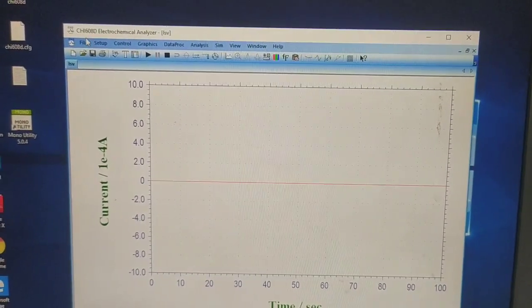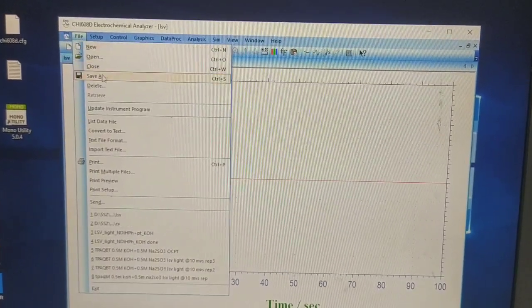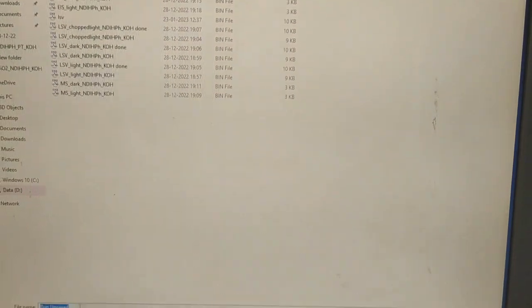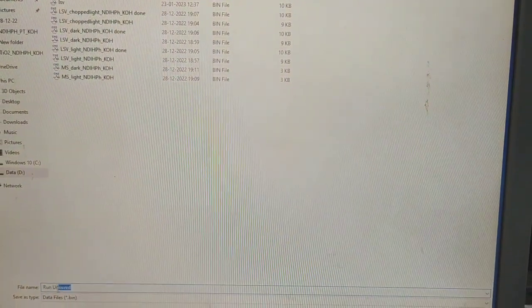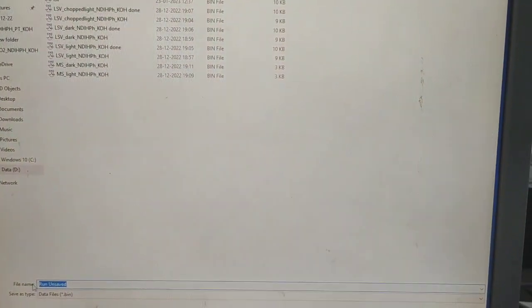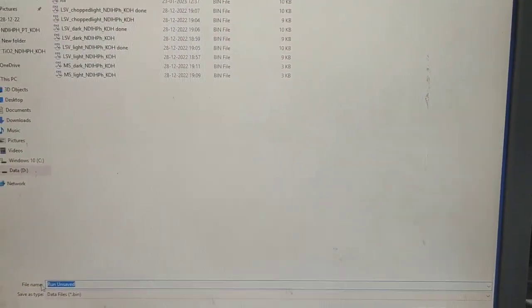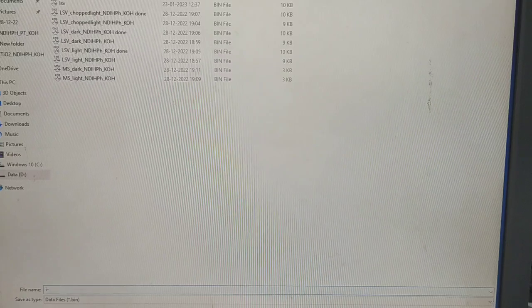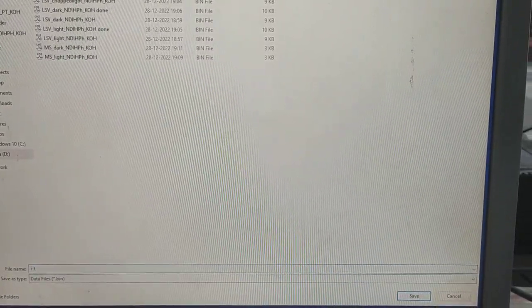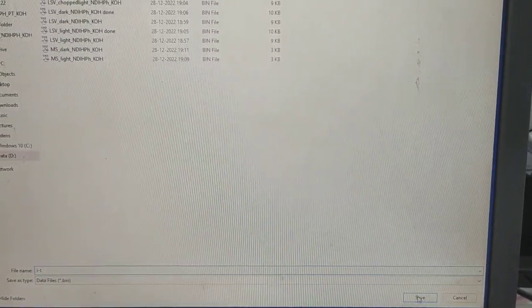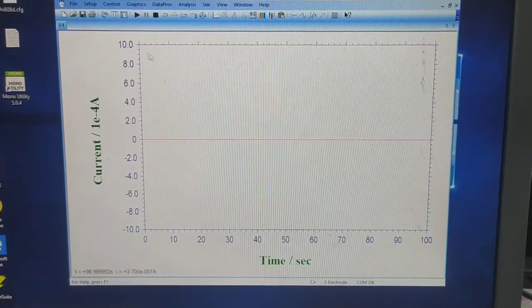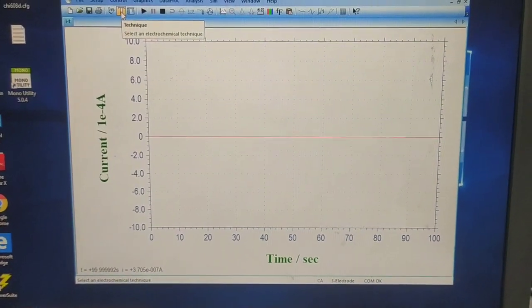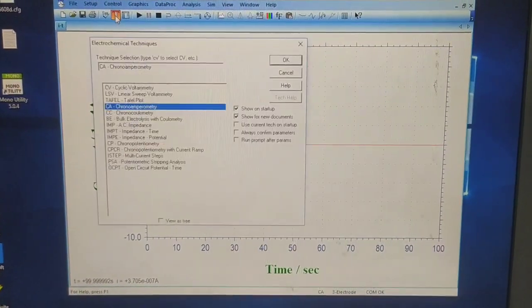The chronoamperometric recording has been completed. Now let's save it. Let us now take another experiment.